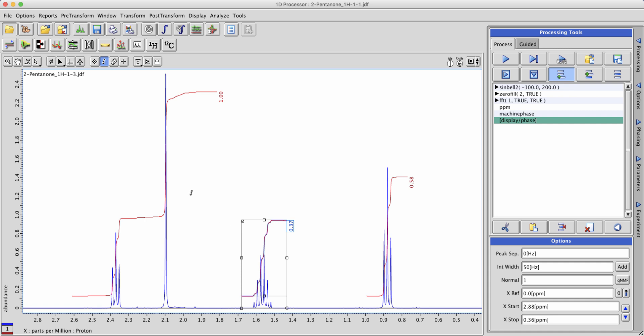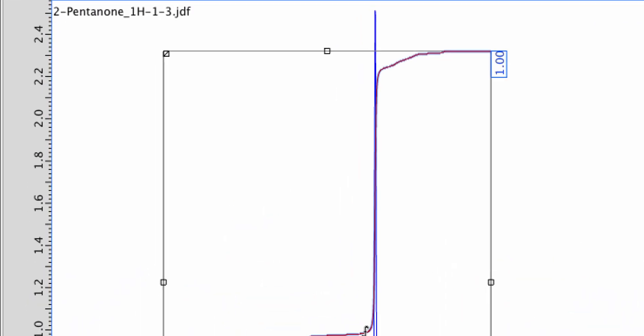Notice in this case that the system happened to draw one big integral for these two peaks rather than two separate ones.